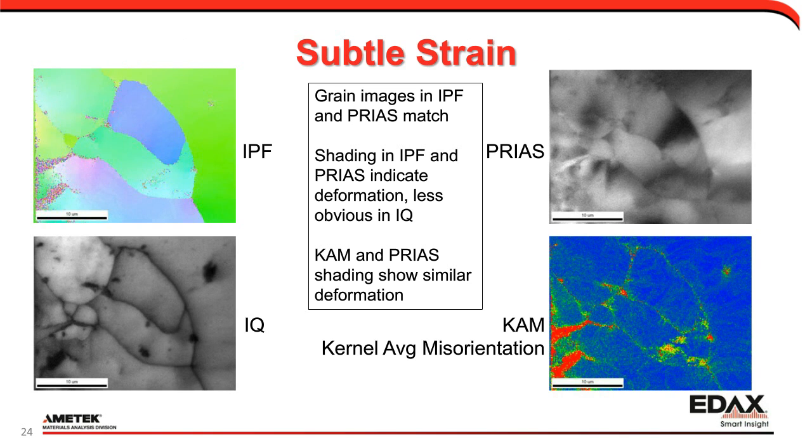deformation within the grains. I like this example in particular because it reminds me of the similarity of the diffraction contrast in PRIAS and that found in TEM images. The central grain in the PRIAS image has a feature which is commonly referred to as a bend contour in TEM. In the future, the contrast in the PRIAS images might be quantified and predicted using similar methods to TEM image contrast.